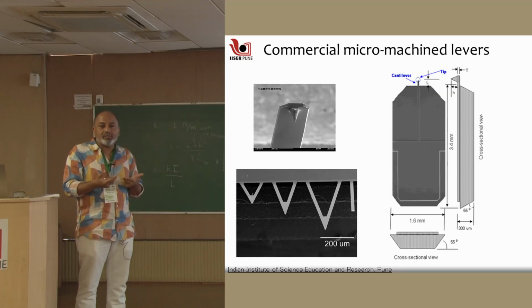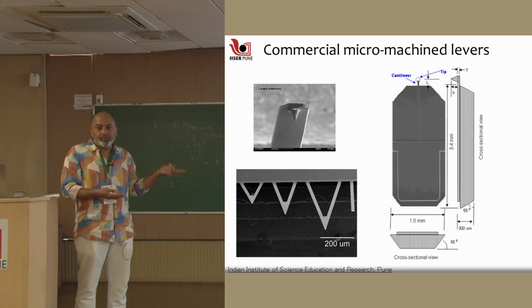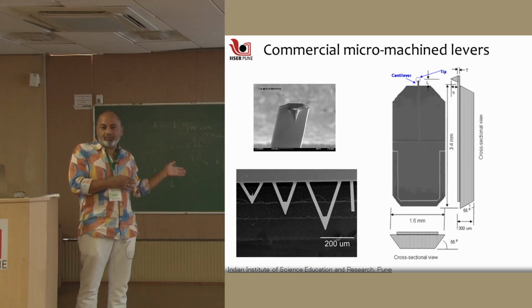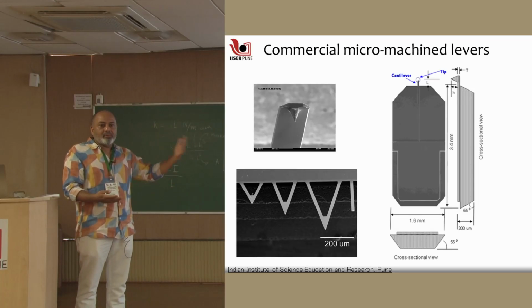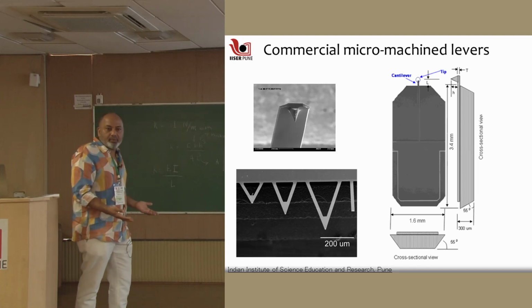One transistor today is even coming down to 100 nanometers. But even at the time when AFM was invented, they said, okay, this is a problem with our cantilevers, the same ones that I used in Pune University, but that is not a serious technological problem. You have a chip industry to get help from, and this is exactly what the people did.